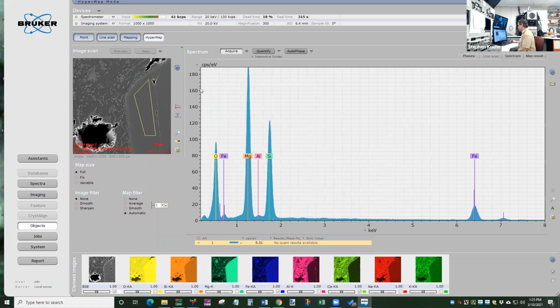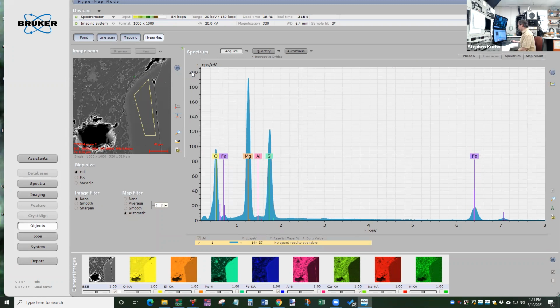And it looks like, based on the chemistry, this really is the green mineral that I was hoping to get to. This has iron in it, has silicon in it, magnesium in it, and oxygen in it. So this is the mineral olivine. And most of the time, if you're dealing with igneous rocks, the mineral olivine is usually olive green, which is a good way to remember it. There are some other kinds of rocks where it might be a much darker color, but if you're dealing with igneous stuff, almost always olivine is olive green. So that's a useful way to try to identify it. So, all right, we have olivine.